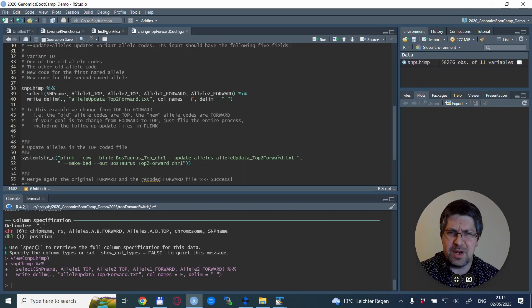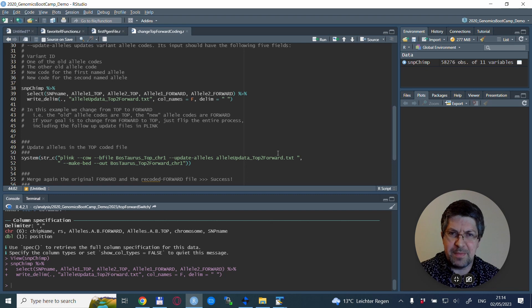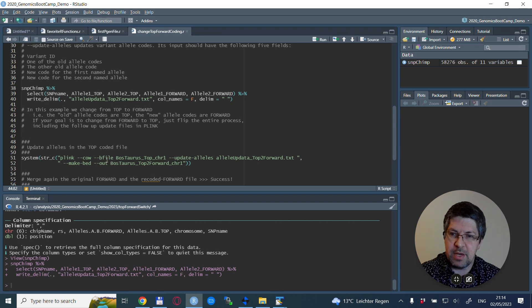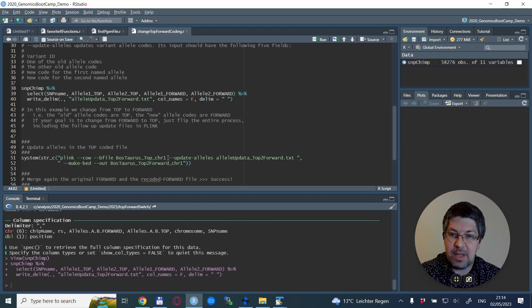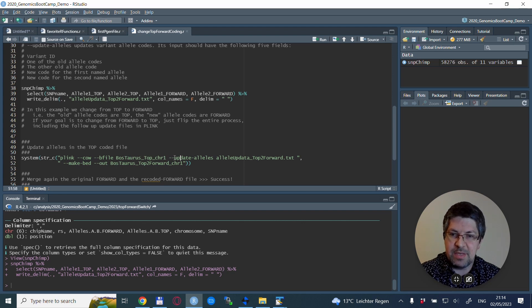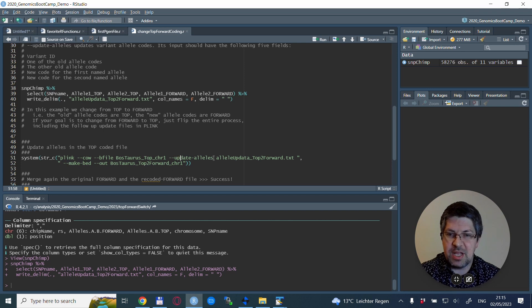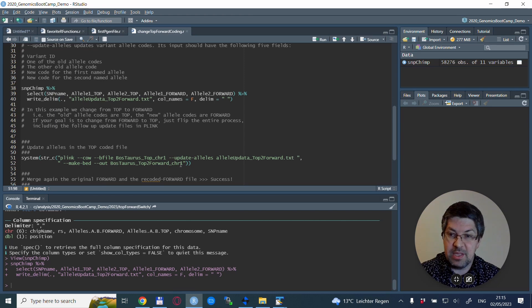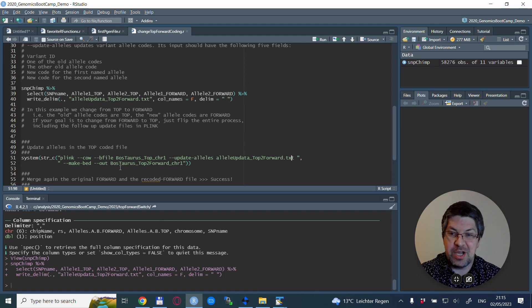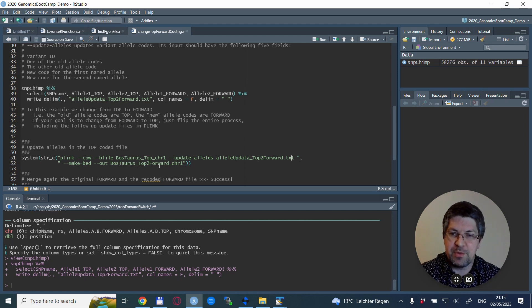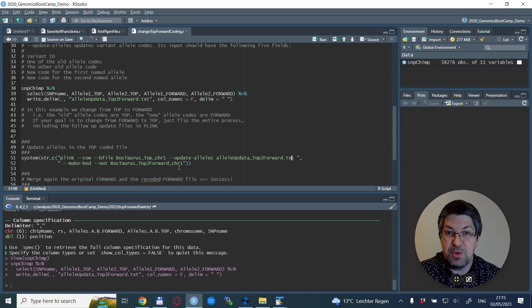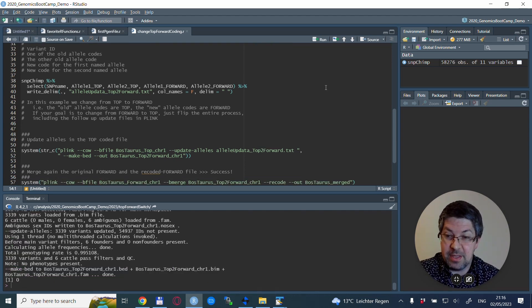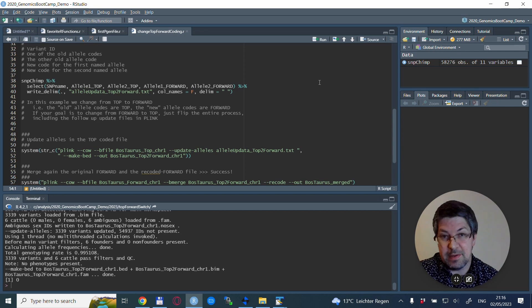Now back in R we move forward with the allele update with PLINK. We use PLINK and we want to update the TOP allele coding file, so we use this with the bfile. We say --update-alleles and give the file name which we just created. We create a new binary ped files with a new name which I named bostaurus TOP to forward chromosome one.